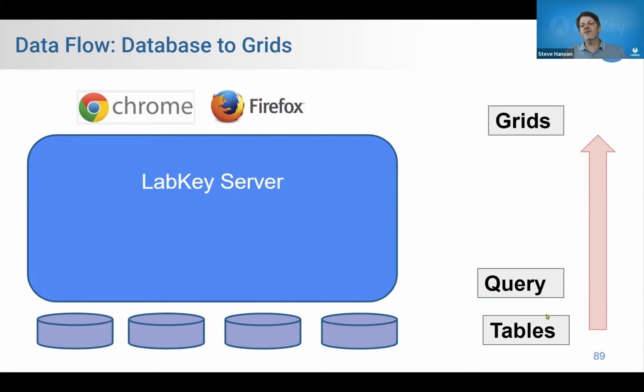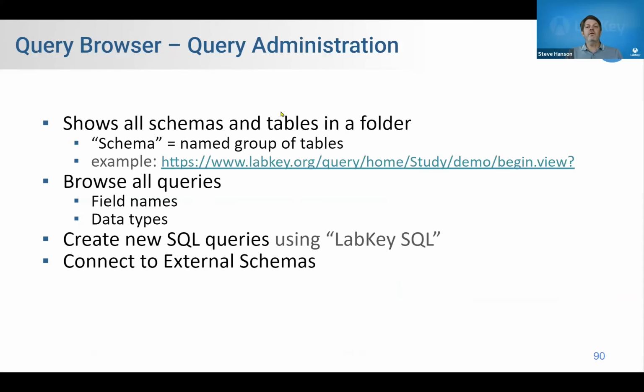Now, first of all, let's take a look at the queries. Like, okay, what are these queries? Well, there's a place on the server where you can see all the queries, and it's called the query browser.